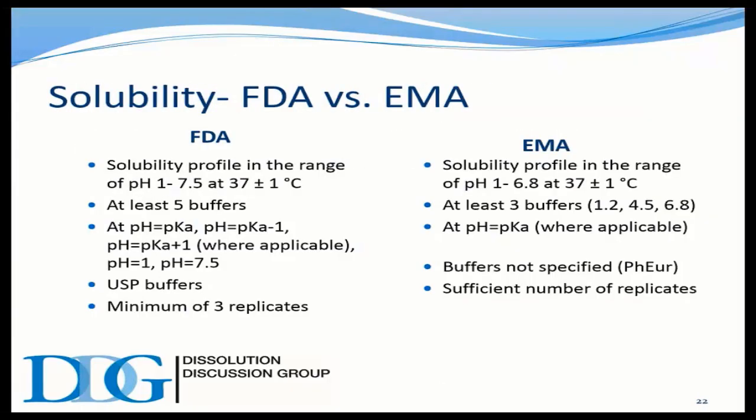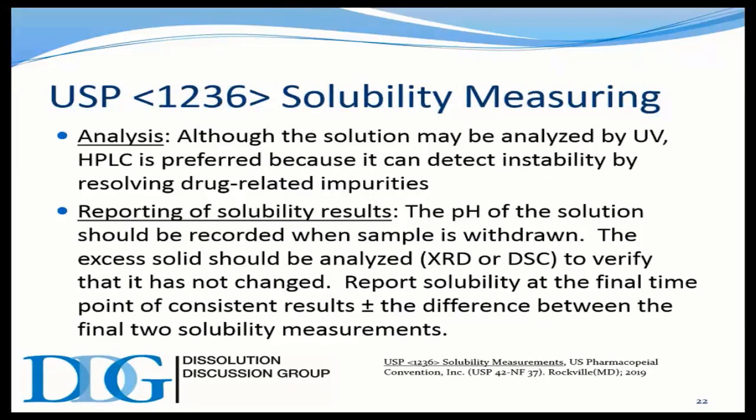Now, Dr. Brian, you do have a question, but the other thing I wanted to add is that in normal method development, when you're coming up with a media, you are measuring whether the pH changes after the dissolution test is done. So it is important to at least make a note of this, and you wouldn't choose it if you have a choice. Sometimes you're just finding out the dissolution for regulatory purposes in a certain pH. But ideally you would not have a dissolution media where the pH did change over time.